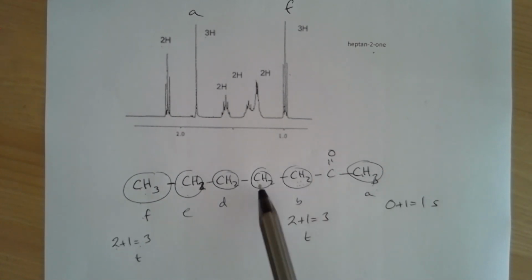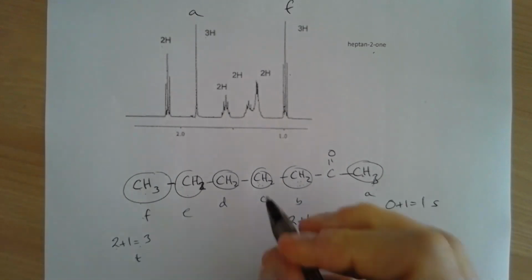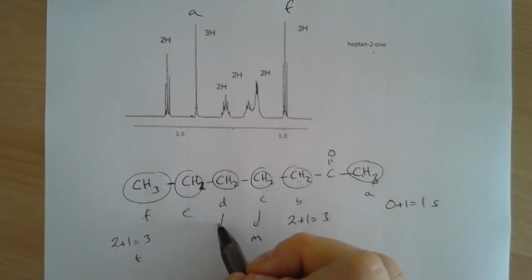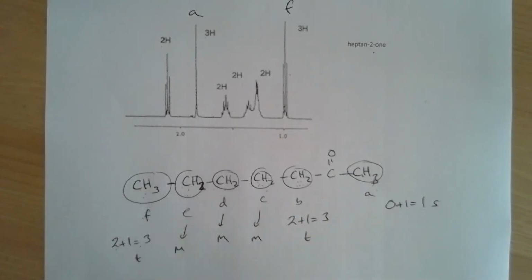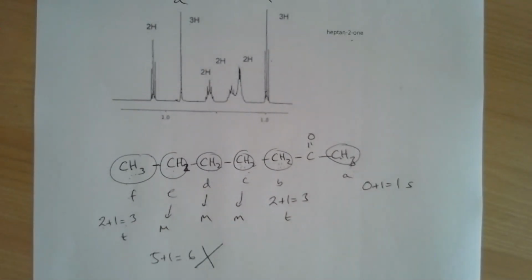Now beyond that, it gets more complicated, and there are ways we can explain it, but because environment C is adjacent to D and B, its signal is simply going to be a multiplet. D is adjacent to E and C, again its signal is going to be a multiplet, and E is adjacent to F on one side and D on the other, so it is going to be a multiplet. It's not correct to say that there's 3 here and there's 2 here, therefore it must be n plus 1, so 5 plus 1 equals 6. That is incorrect. There are other factors that are going to take place.